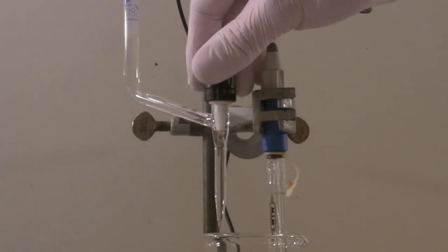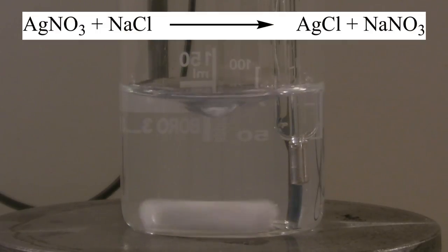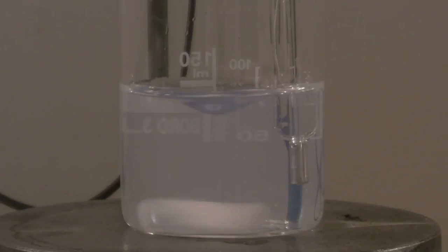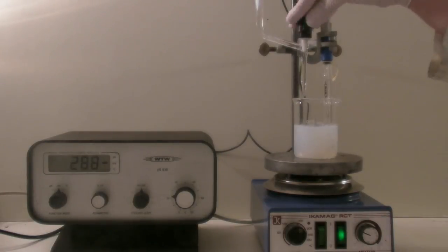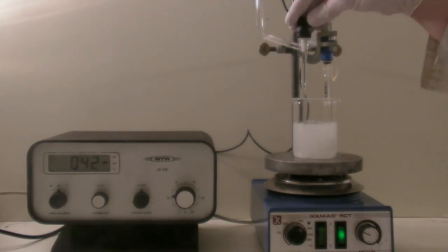At the beginning, the solution was added in large portions. Due to the formation of silver chloride, the solution became turbid. Usually, the titration is done several times, where the first one is done sloppy to find the equivalence point. From the second time on, the size of the portions is then made smaller just before the equivalence point. The concentrations were almost the same, so the equivalence point had to be around 10 milliliters.